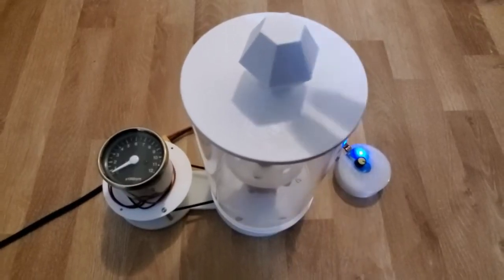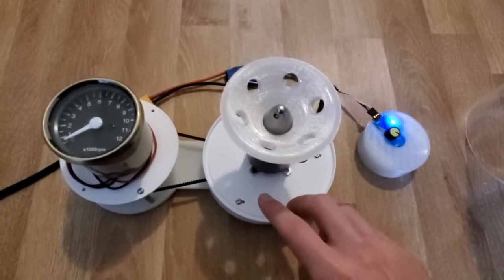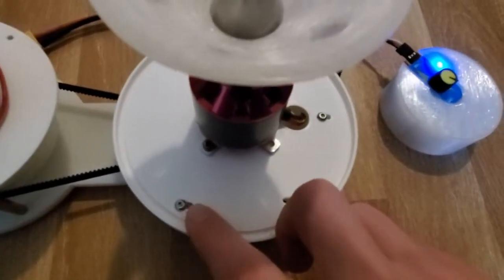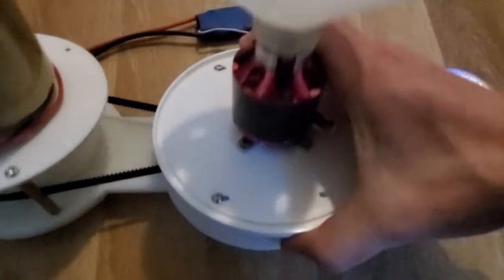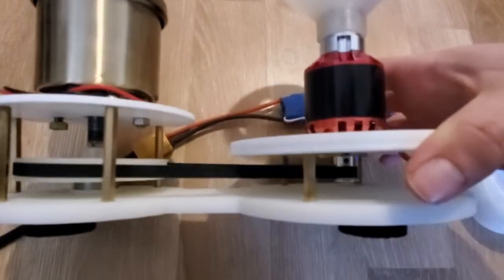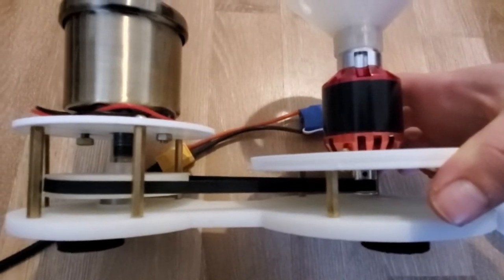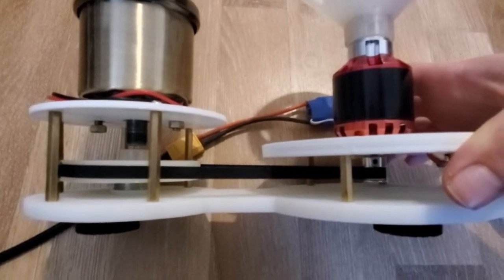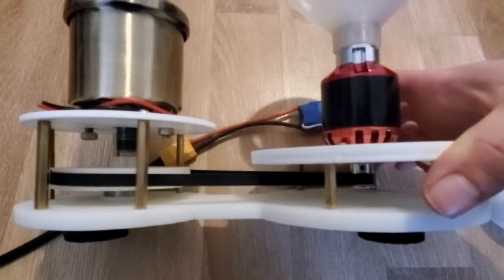Some of the other major changes are, for example, the introduction of a belt tensioning system. As you can see, these screws have slots, which allows this plate to slide back and forth and provide tensioning on the belt system in here. Additionally, I switched the gearing so that the small gear is 16 teeth and the larger gear that's 3D printed on the left is 112.